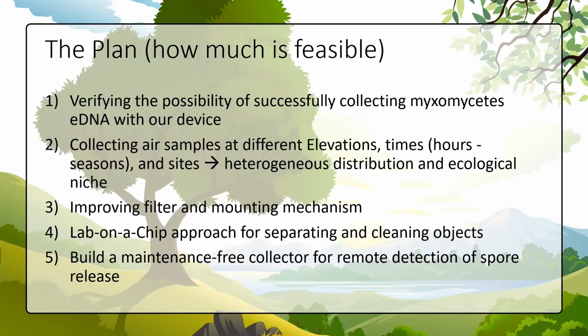Therefore, there are quite a lot of components that need to be looked at. Five or 10 spores is feasible and gives you a high chance that you detect something, but it's just interesting how far you can go down and still detect something. And what was the species? I forgot. Some Meriderma.